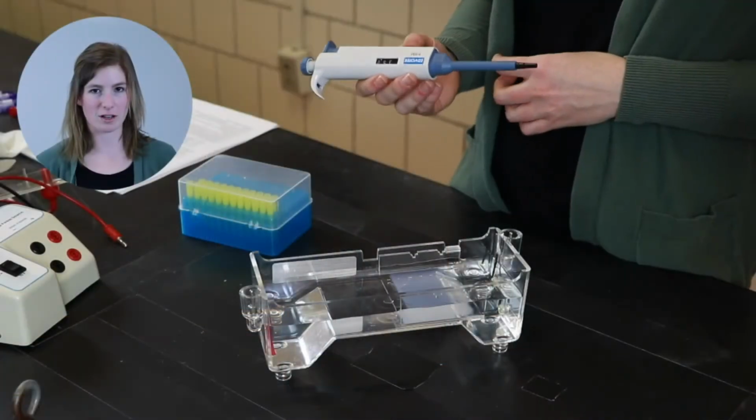We're going to be using really small amounts of sample, and so we're going to use something called a micropipette. We know micro tells us that it is small, right? And so this is used for very small amounts of liquid.